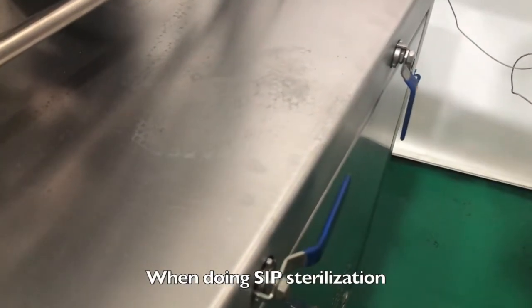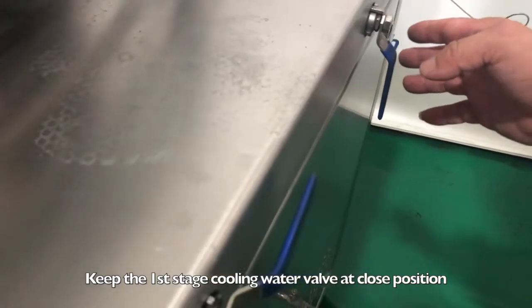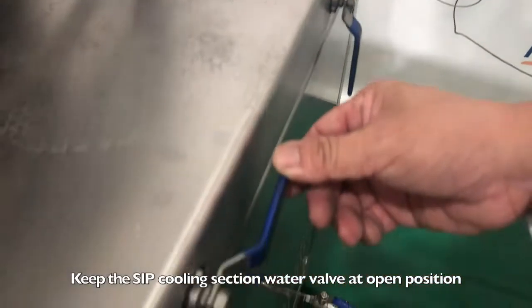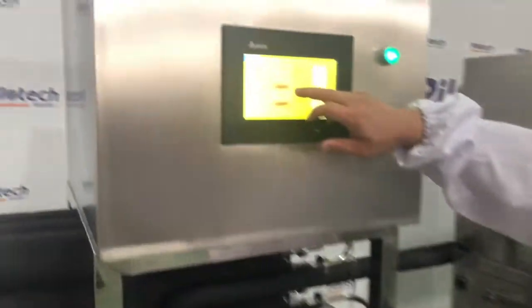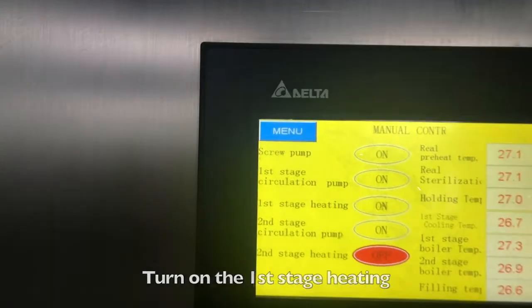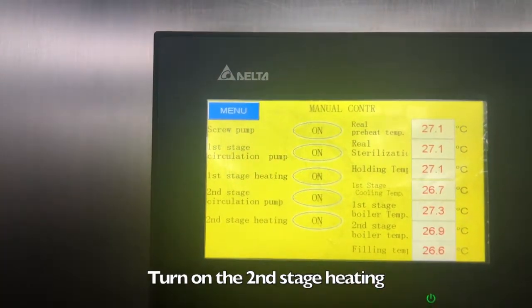When doing SIP sterilization, keep the first stage cooling water valve at the closed position. Keep the SIP cooling section water valve at the open position. Turn on the first stage heating, then turn on the second stage heating.